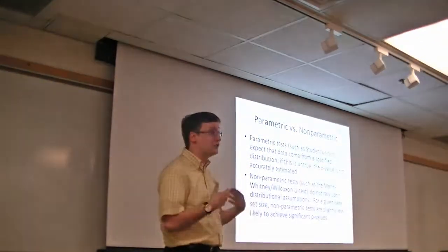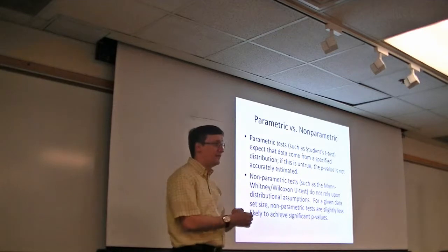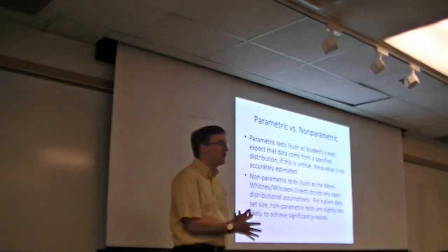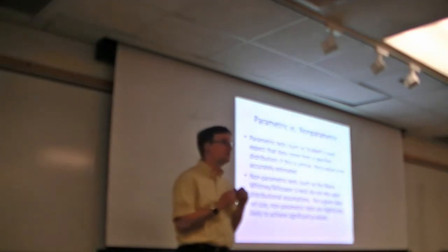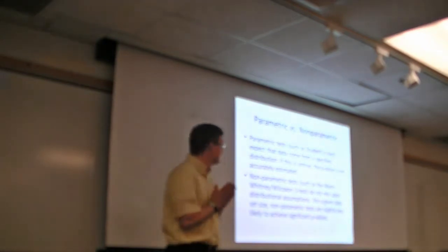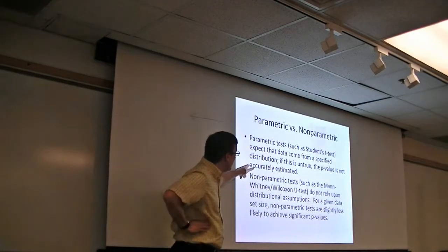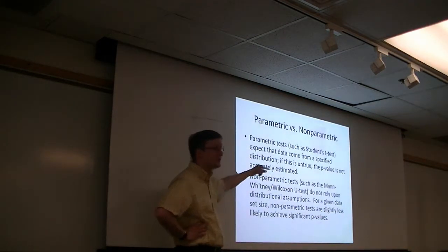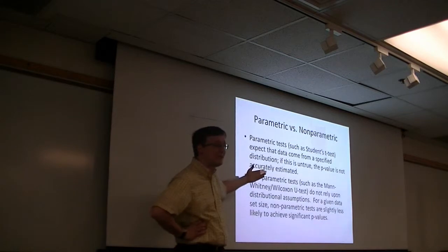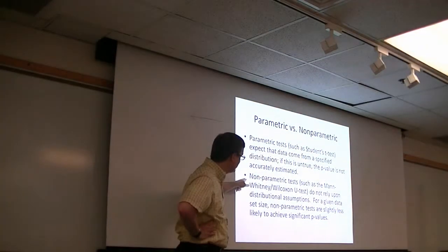Specifically the Gaussian or normal distribution. So if the variation that we see in our values is not Gaussian, using a t-test is going to produce skewed p-values. That's not okay. So if you want an accurate estimation, make sure that the test you're applying actually has something to do with the underlying data that you're working with.